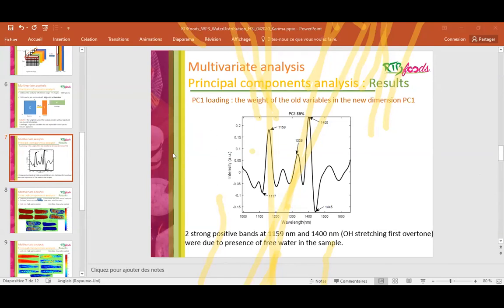Let me maybe add, Dominique, for example, when you go into starch analysis, starch distribution in the tuber, maybe in potato and sweet potato, you can see if the genotype is good for French fries production, because the starch needs to be very well distributed in the roots and in the tubers to get a good French fry. That is an application for this technique, for example. This is just an example, of course.